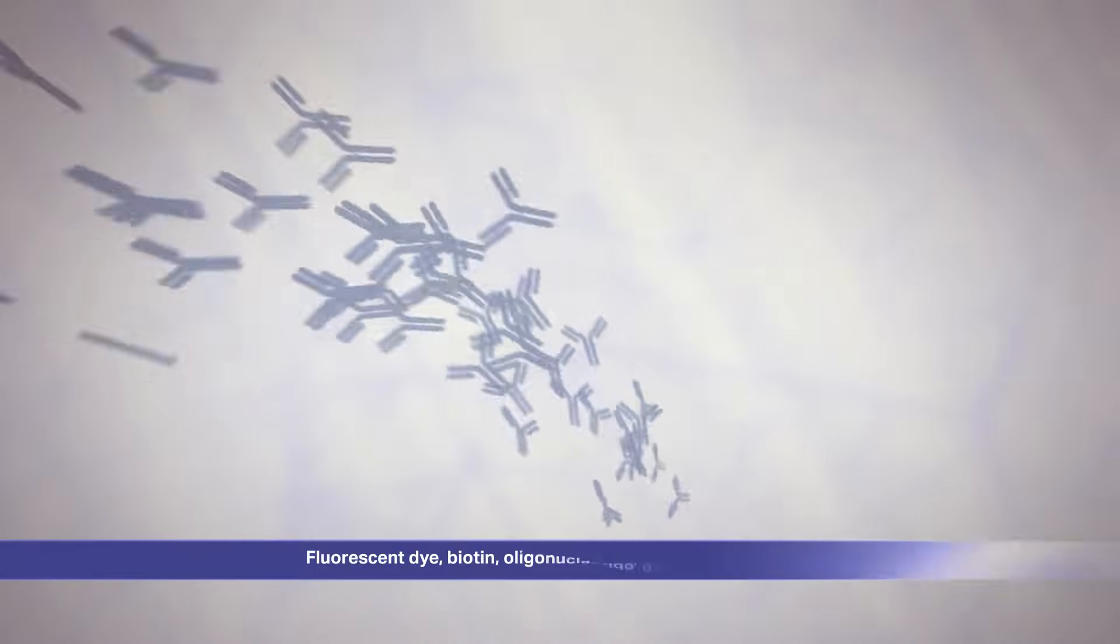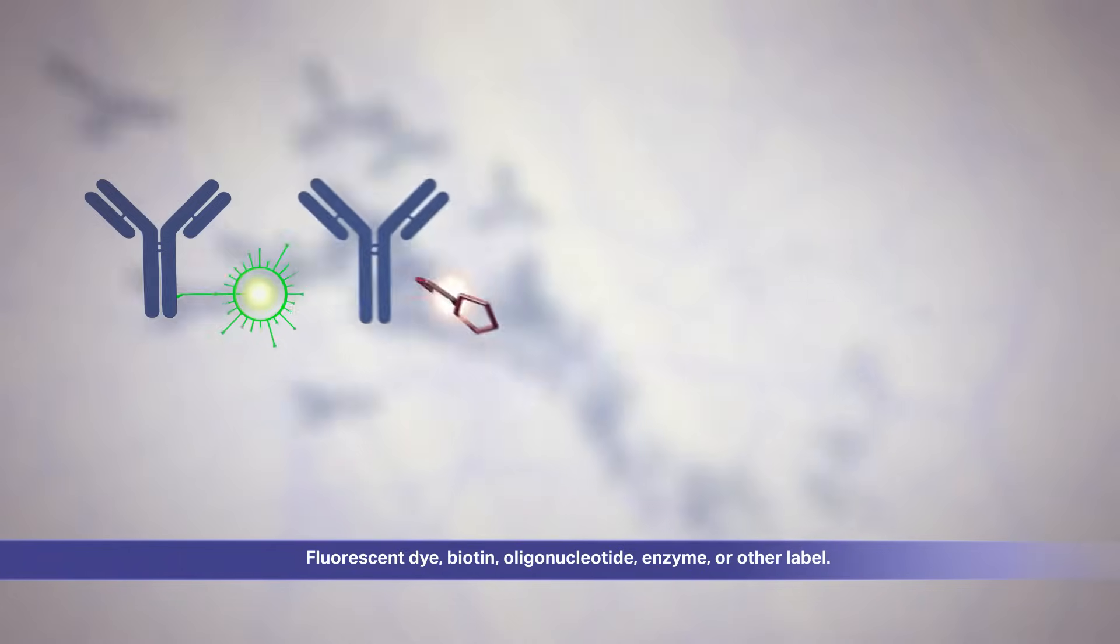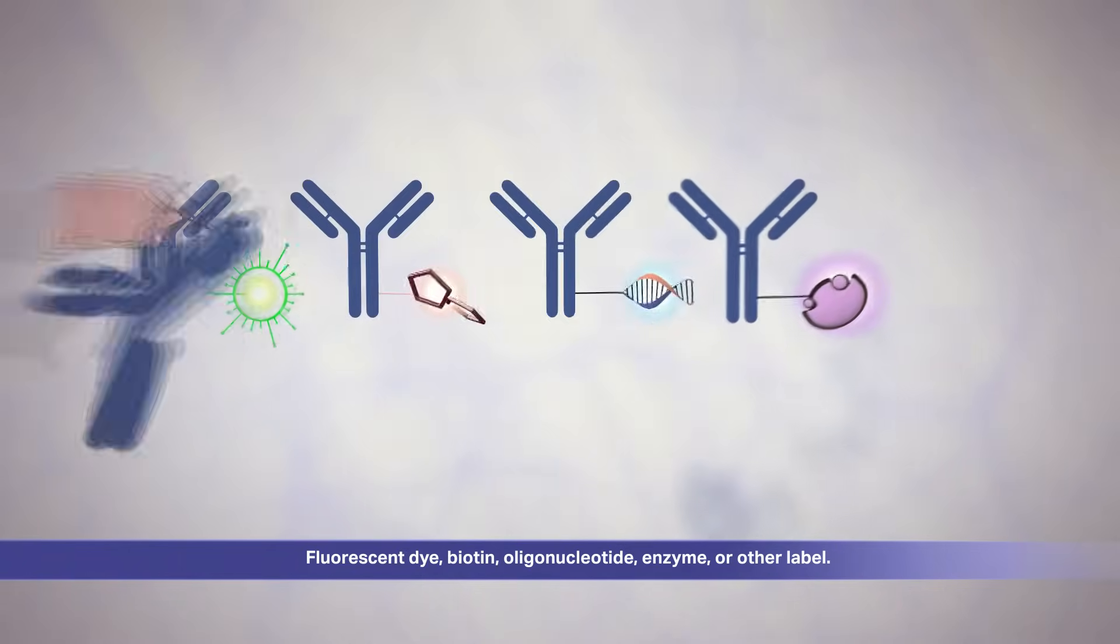If you use antibodies in your research, at some point you will probably need to conjugate your antibody with a fluorescent dye, biotin, oligonucleotide, enzyme, or other label.